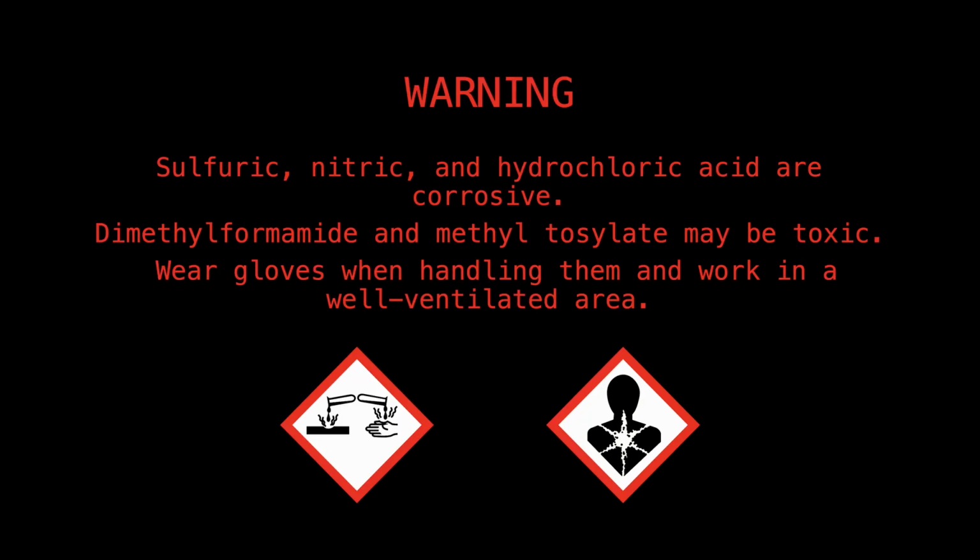Warning: sulfuric, nitric, and hydrochloric acid are corrosive. Dimethylformamide and methyl tosylate may be toxic. Wear gloves when handling them and work in a well-ventilated area.